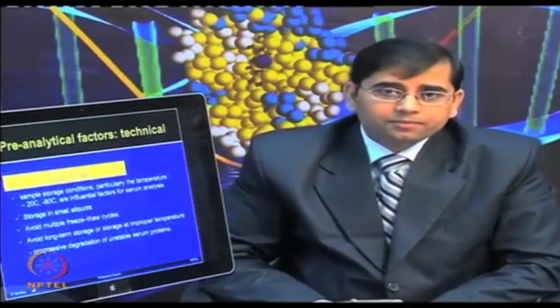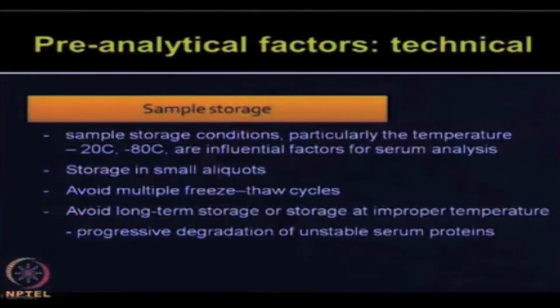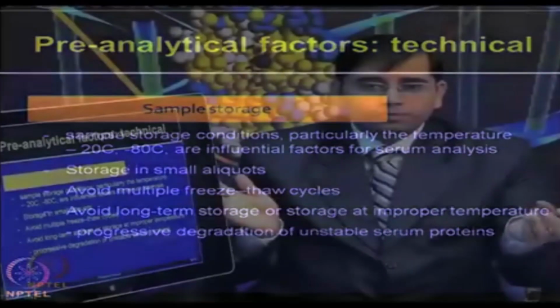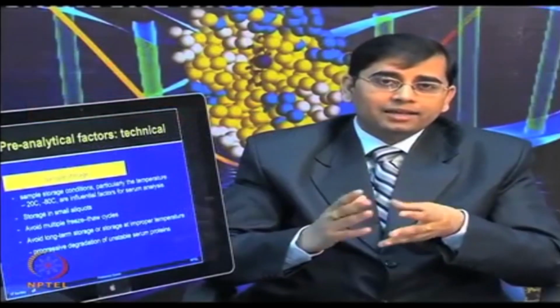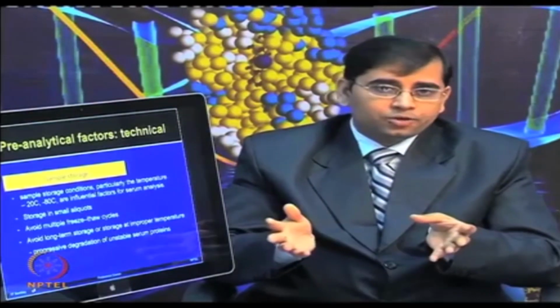Sample storage is another very crucial factor, whether you are storing your clinical samples at -20 degrees centigrade or -80 degrees. How quickly you saved the clinical samples, or how much delay there was before the sample was collected and stored, all of these small variations influence the proteome analysis later on.